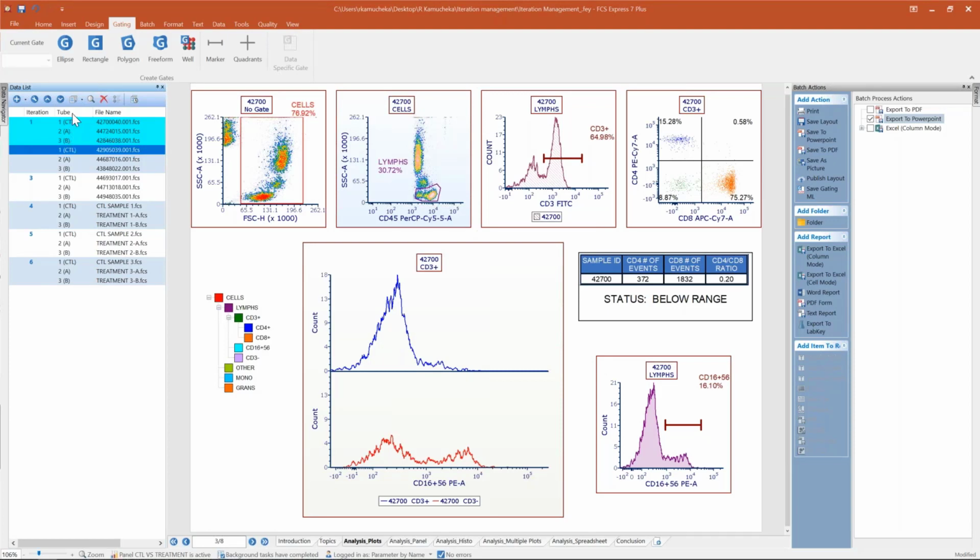Again, that's why I said that labeling your 1, 2, and 3 within this iteration, like Control A and B, gives you a way to make sure that the correct data files get into the correct space.